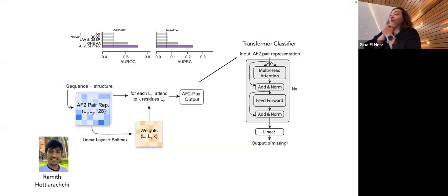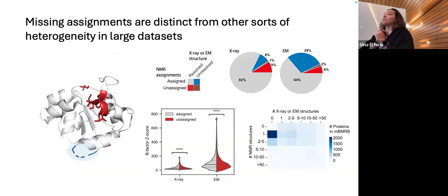Question about different kinds of data related to that. Have people also tried training on residues that are missing in crystal structures, that don't have any density? I haven't seen anyone do that. But the data that we have is very distinct from the data that's missing in X-ray, or even the data in cryo-EM. I'm certain that if someone were to tabulate that, we would get other interesting, important information from the X-ray data that we could incorporate. But I don't think anyone to this day has done that, to my knowledge. I'd love to be proven wrong.